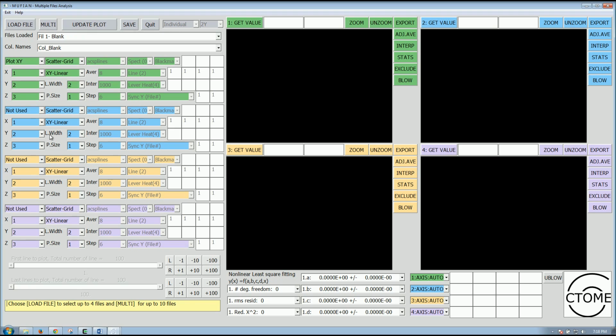It's just each time you change certain conditions, you will want to apply those new conditions by pushing the update button. If you want to export some graph, it's going to be the button save, and if you want to quit the software, the button quit.